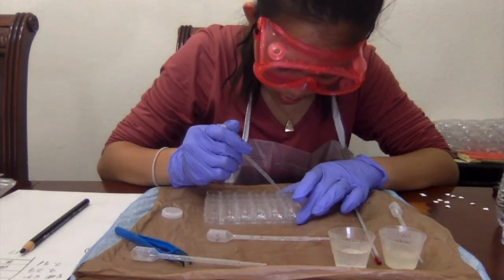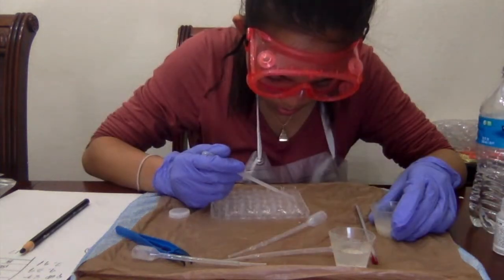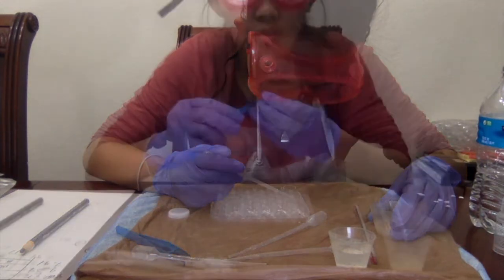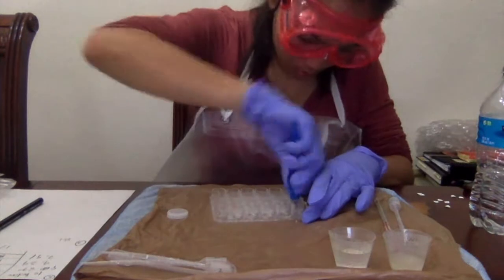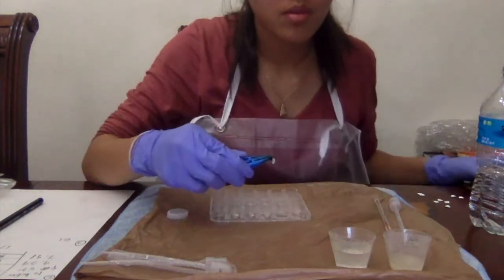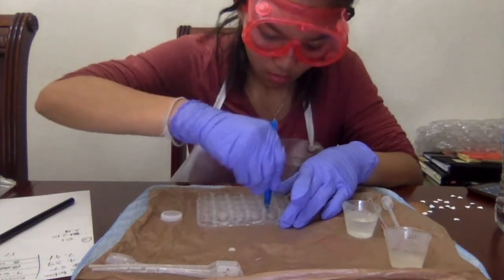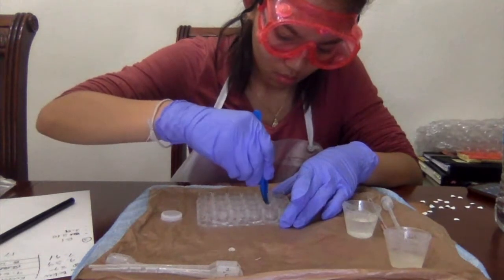Next, the base sodium hydroxide was tested. The pH range was 12.7, 11.7, 10.7, 9.7, and 8.7. Upon observation, the average time for each pH was 21.05 seconds, 10.17 seconds, 10.09 seconds, 10.42 seconds, and 11.04 seconds respectively.